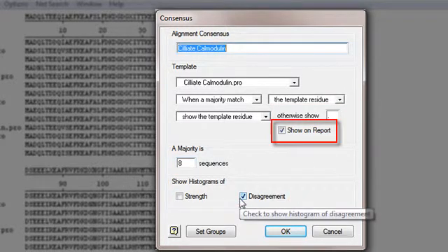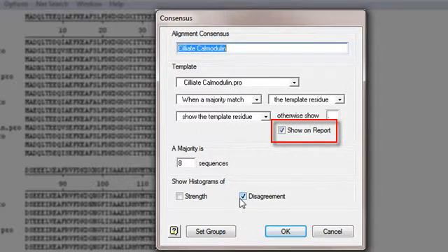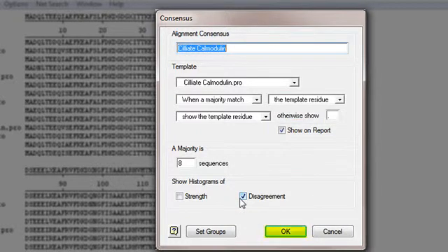I want to display the consensus on the alignment report, so I make sure that show on report is checked. Then I click OK to render the consensus.